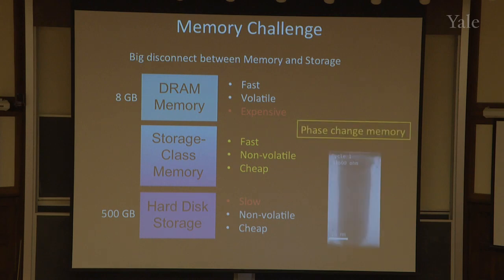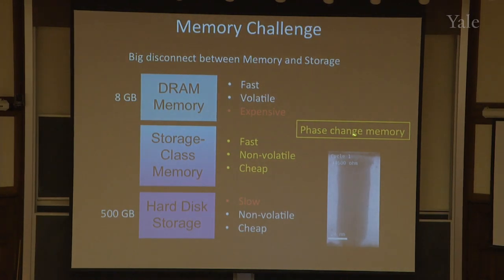And now, by running TEM movies, we think that this material called phase change memory, this memory technology, can really be the way to make this new technology come true. So perhaps we can change the title to Memory Challenge Solved.